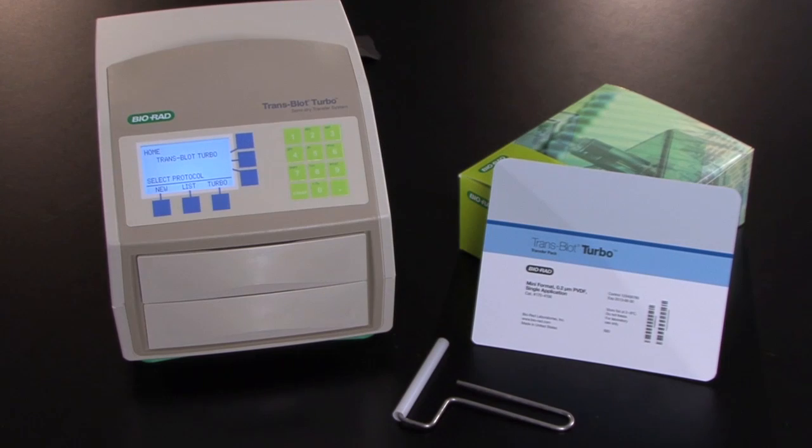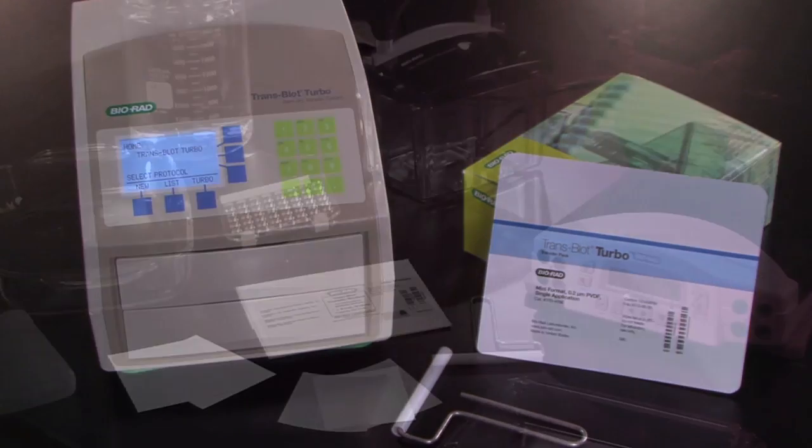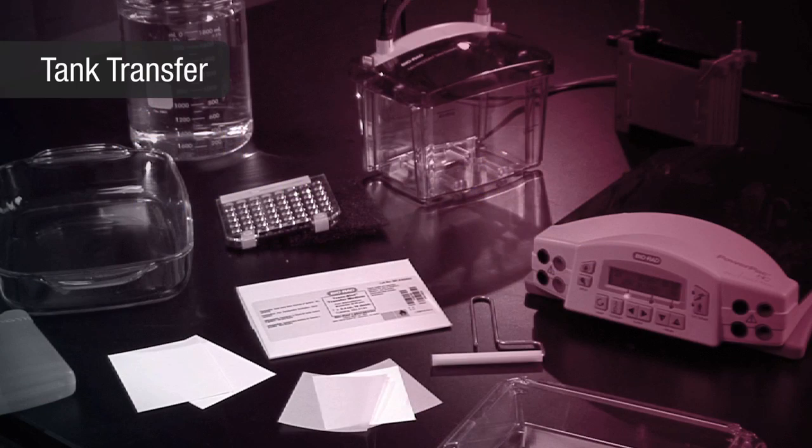The convenience of the Trans-Blot Turbo system is demonstrated by the number of components needed for blot assembly. For tank transfer, you need a Mini Trans-Blot electrophoretic transfer tank, a Mini Trans-Blot module, a power supply, ice pack, and stir bar.